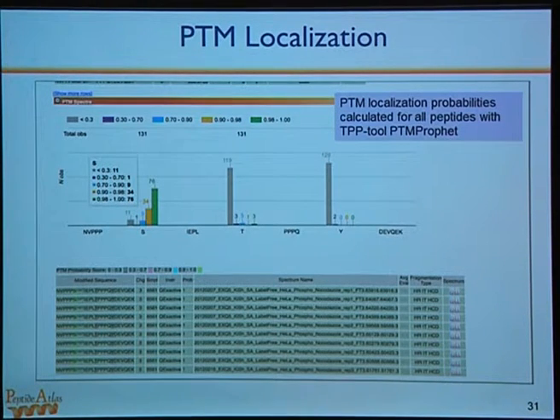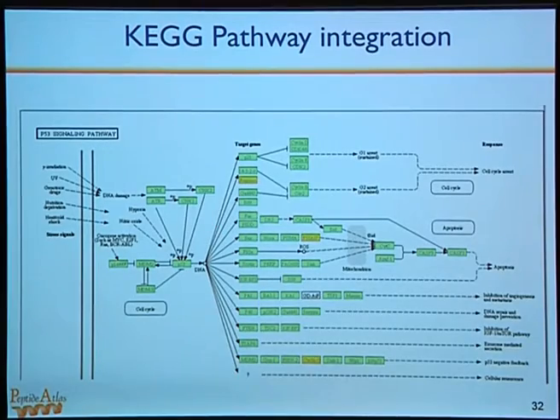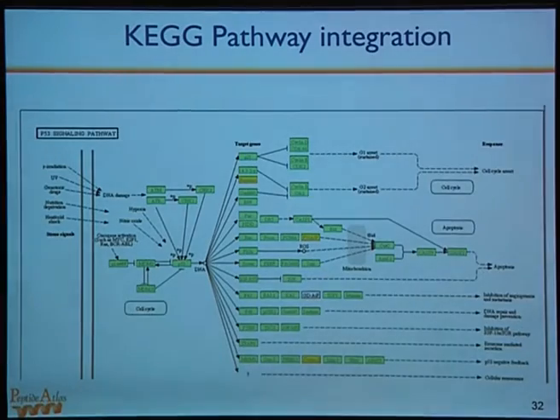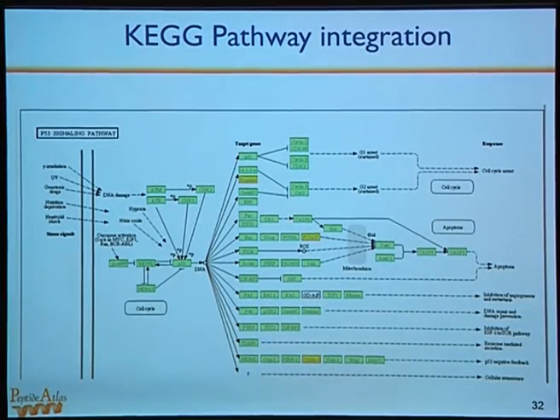As you'll see later, the phospho build is actually quite big, and so we've covered a lot of phosphosites. And that's not just because we've done a lot of phosphoproteomics, but rather because a lot of people in the community have, and we've obtained those data sets. Those are the ones that we have data for in this PeptideAtlas. And you can click on that and go to essentially see those things within the context of the PeptideAtlas.